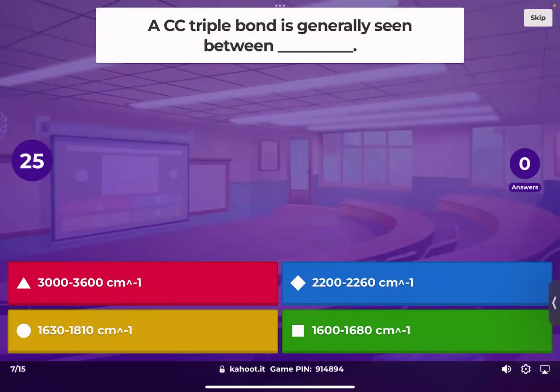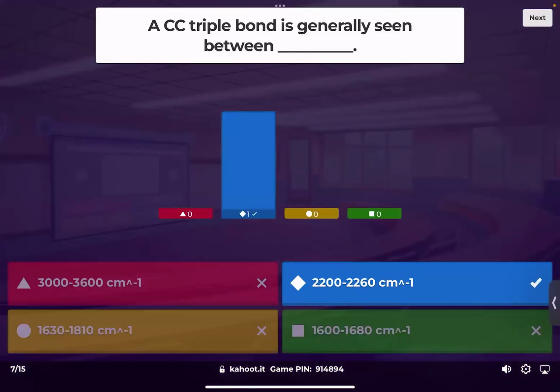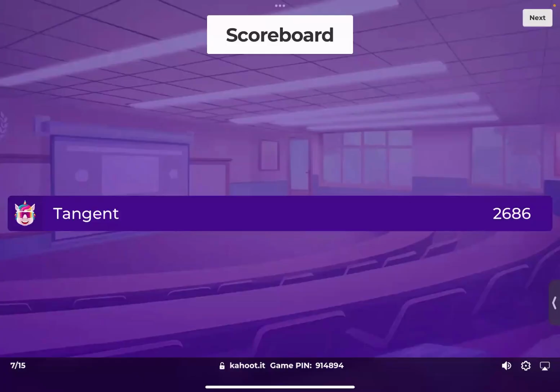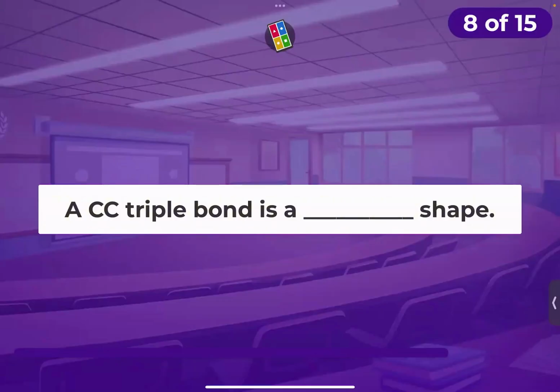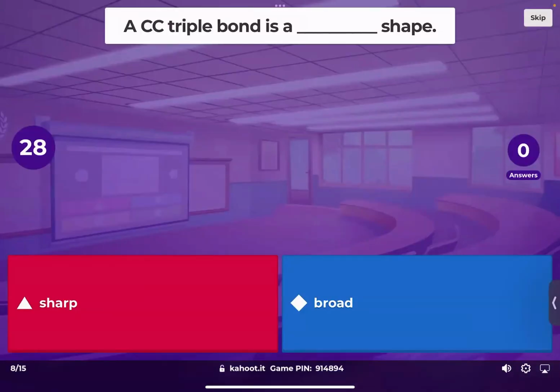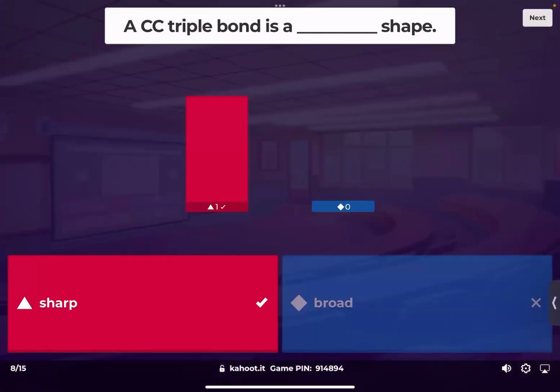No. The C triple bond is okay. So triple bonds come between the crazy stuff and the double bond. Right? Yeah. No, it's behind 3000. I think it's this one. Oh yeah. Nice. A linear? Start. Curve, yeah. The only problem, really, is the very end, where it gets crazy, the fingerprint region.